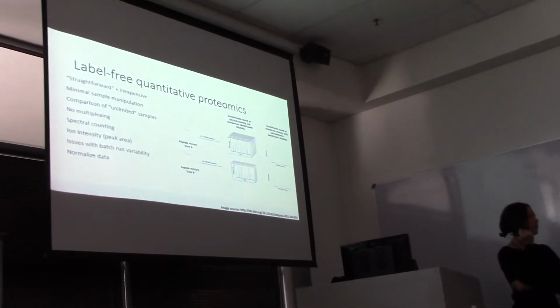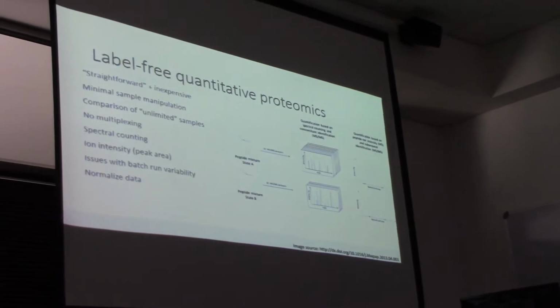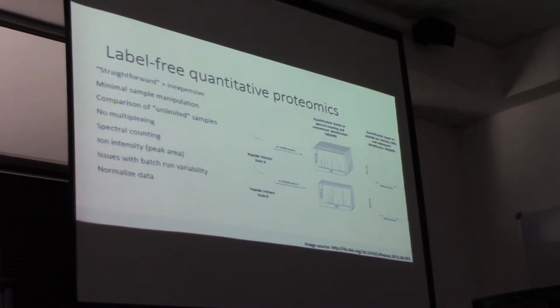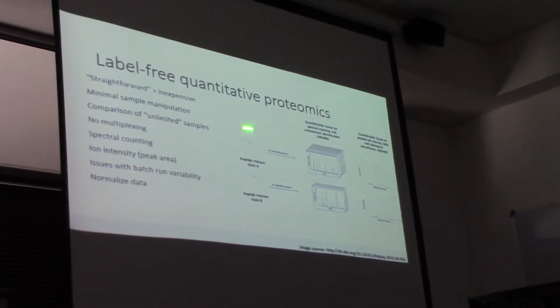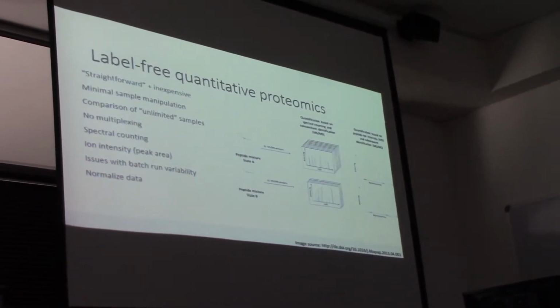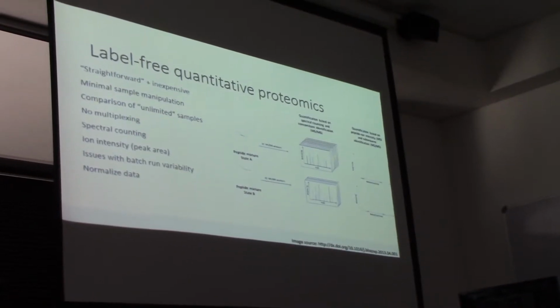Did Dave give you an SRM lecture? I think he did. Maybe once upon a time. He sent me slides and he said he presented at UWC, so I haven't really gone into it. He did SRM and apparently label-free approaches. Spectral counting, okay? No? Alright. He might do one at some point, really detailing this.